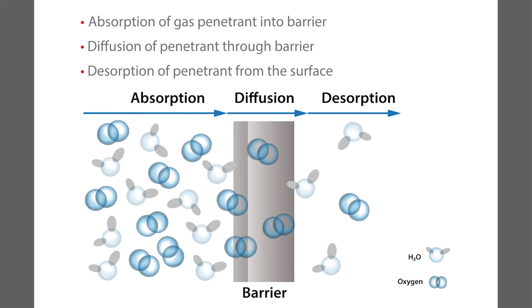And for some people, that's actually important because they may not consider that the package itself might be contributing to the amount of oxygen or water vapor that their product sees. So sometimes gathering that curve and doing things like integrating the area under it to understand how many cc's of oxygen are going into their product could be very interesting, especially if you're packaging a serum or something like that.